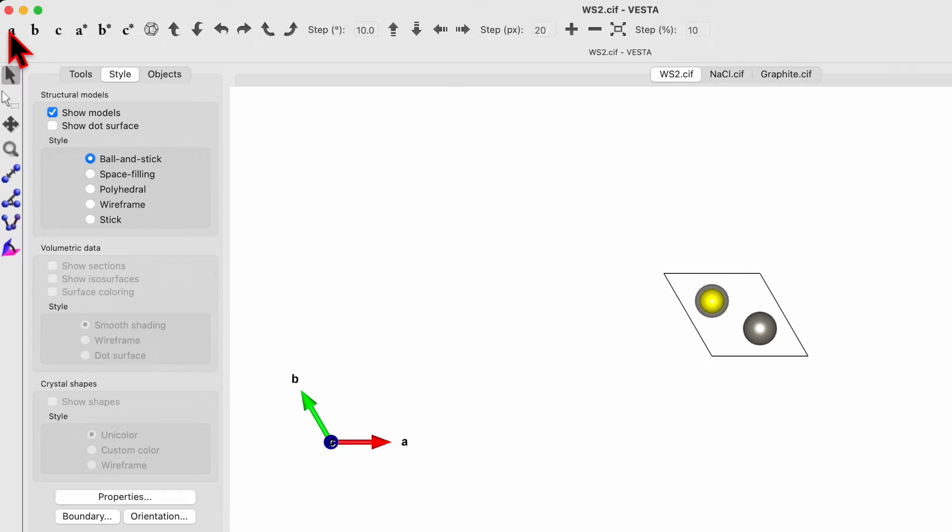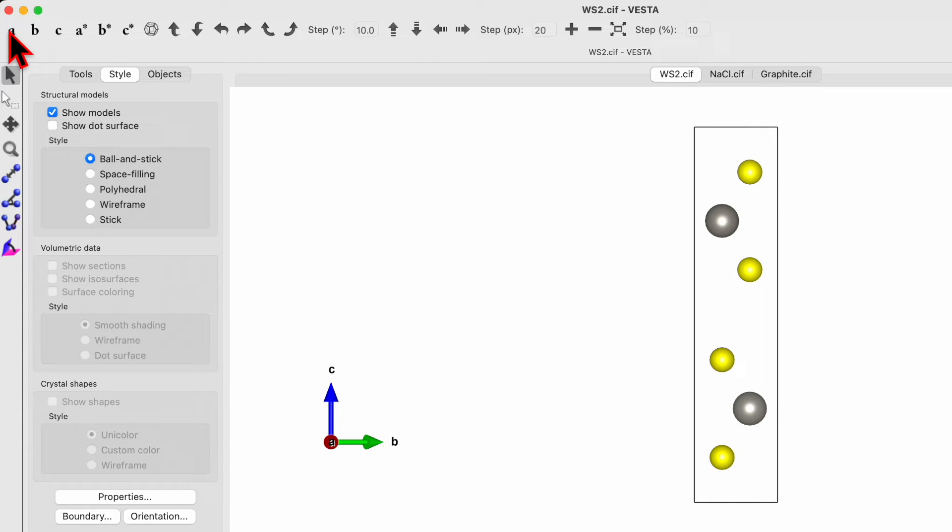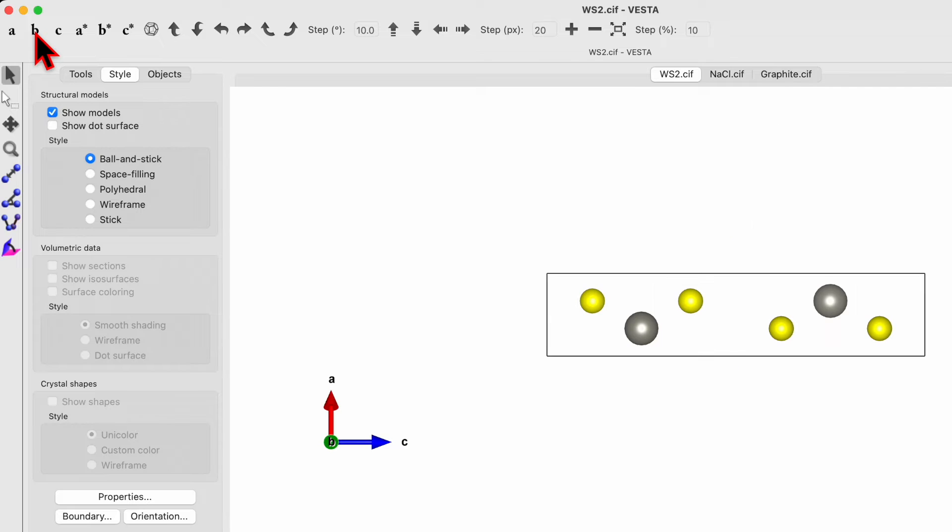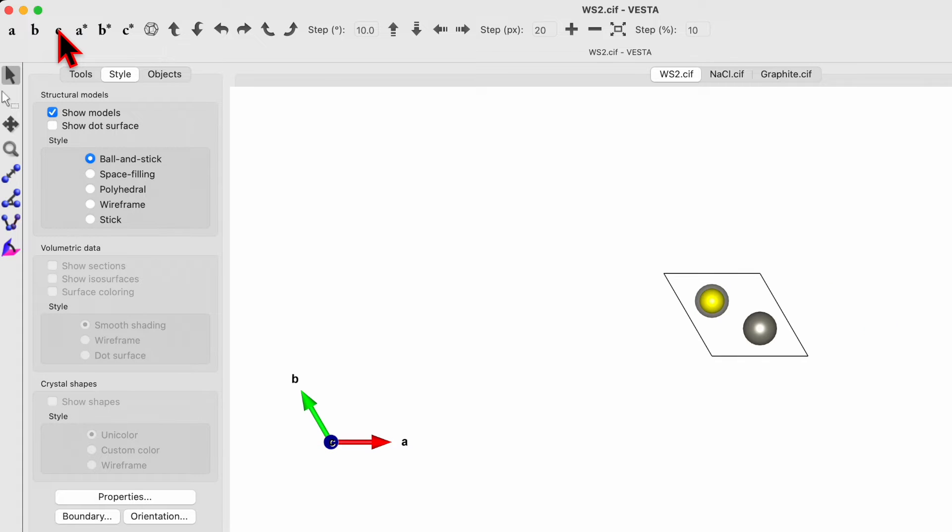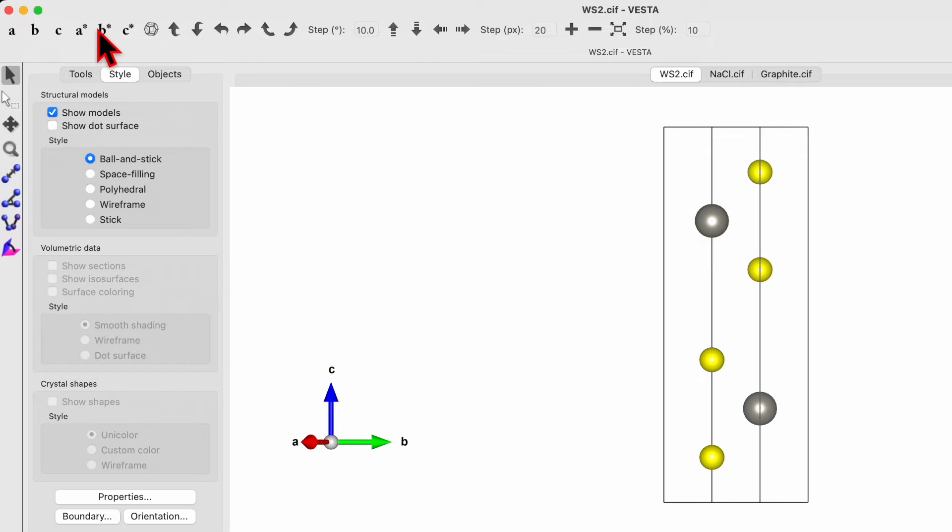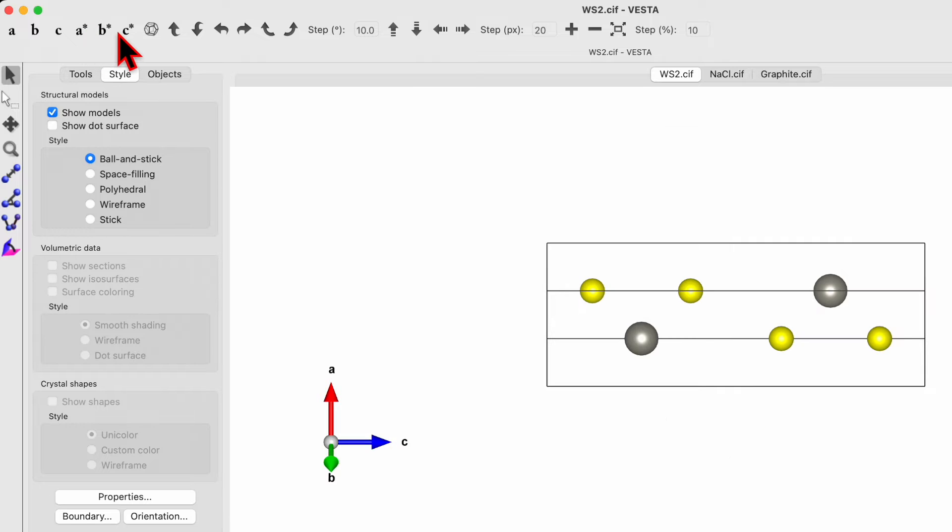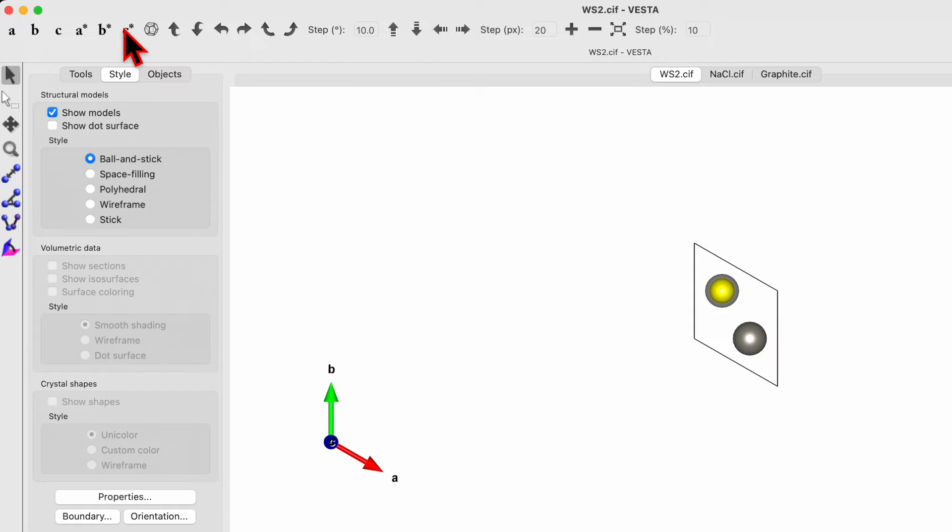Let's consider example of WS2 and do the same. View along the A axis, view along the B axis, view along the C axis. Then view along the A star, B star and C star.